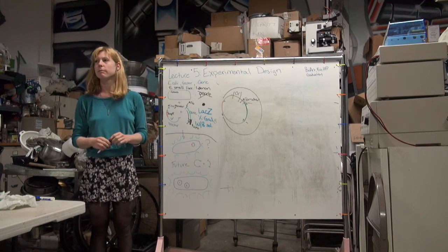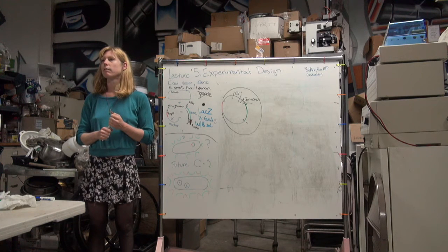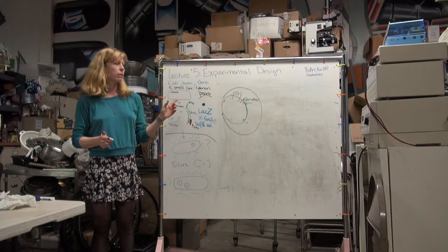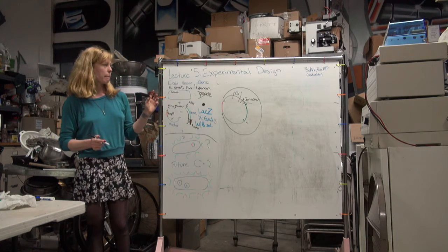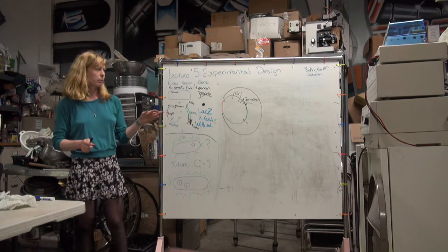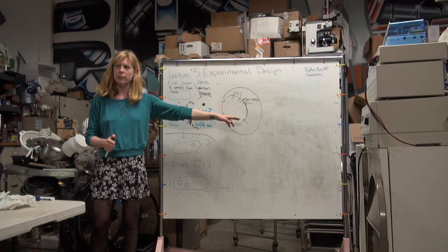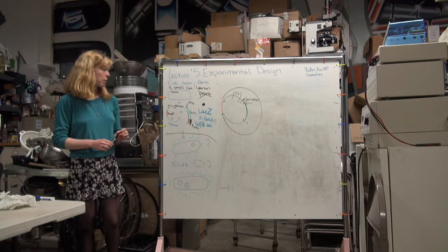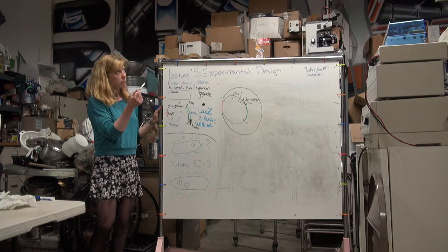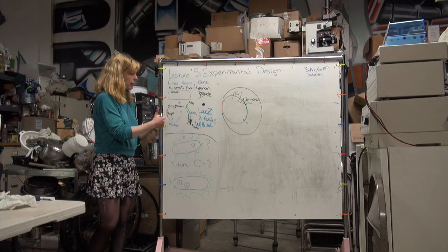So you would wait to get a population that has both the ampicillin resistance and the gene of interest. Basically, the only E. coli that's going to grow is going to have this combination.